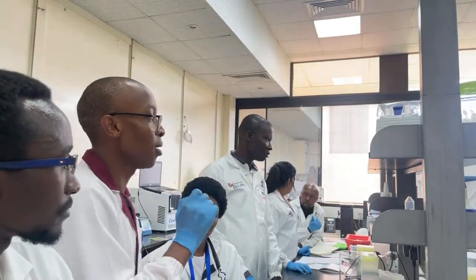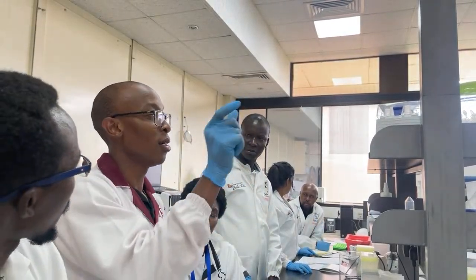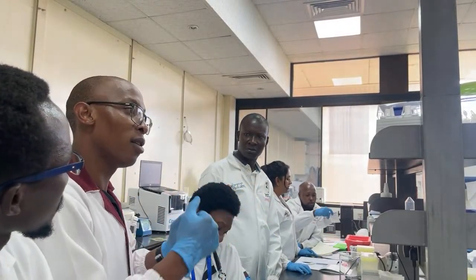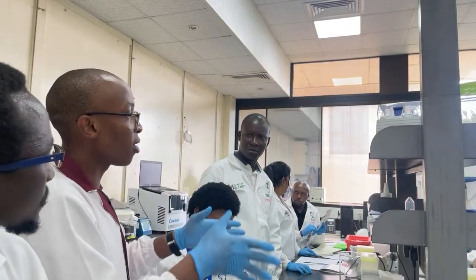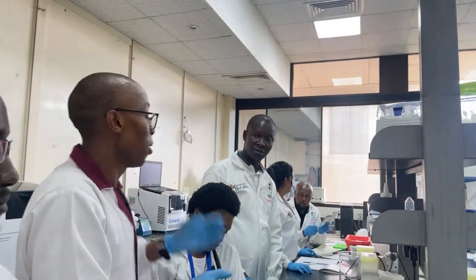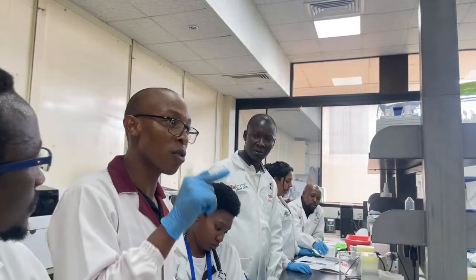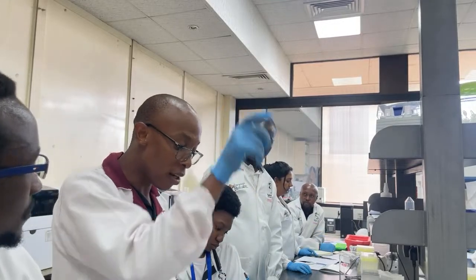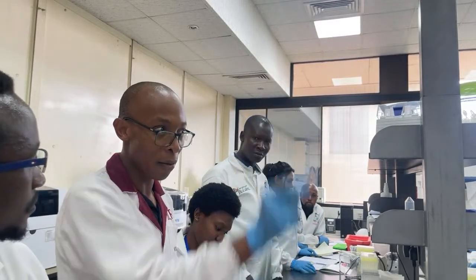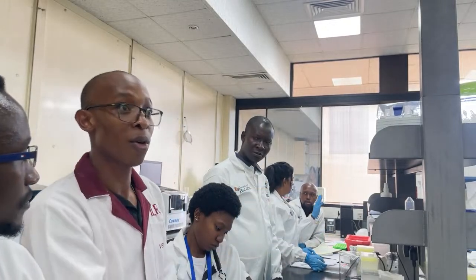So let me just finish that. We used to use this one, but it's not accurate. The margin for error is quite high. So there's another one called the Fragment Analyzer or the Femto Pulse. They are very specific. If you use this one, the PacBio machine will tell you if your estimation was right or not. When the run is complete and you go into the QC metrics, it will tell you the average size of the fragments that were actually sequenced. Then you will know if you were out or in.